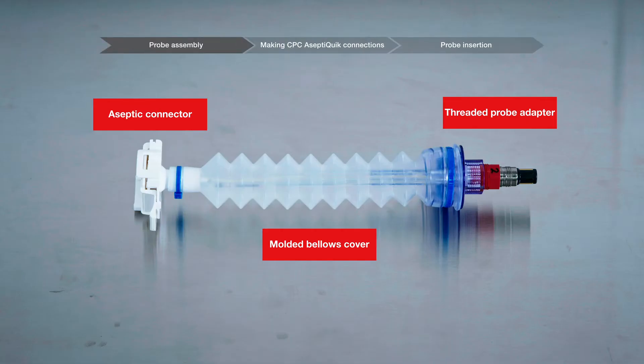The probe assembly is an innovative design to package user-supplied pH and dissolved oxygen or DO probes for sterilization, and to aseptically connect them to the BPC. The probe assembly includes an aseptic connector, molded bellows cover, and threaded probe adapter.